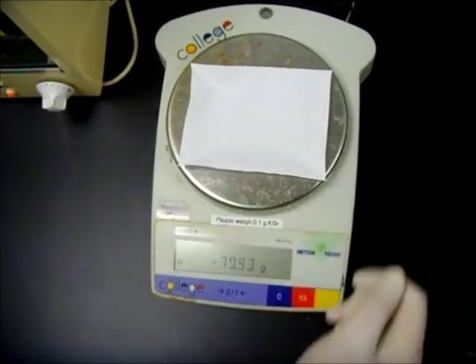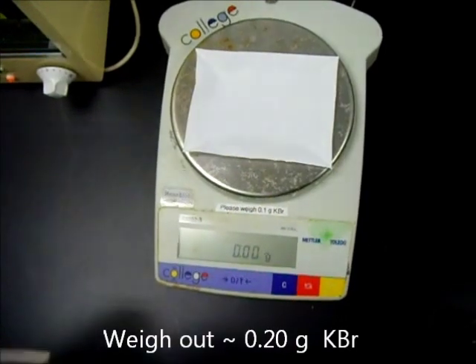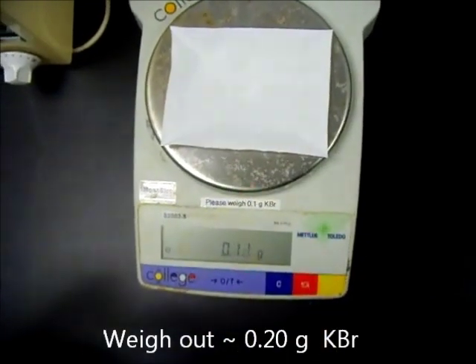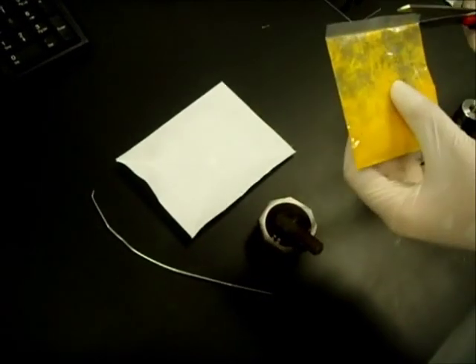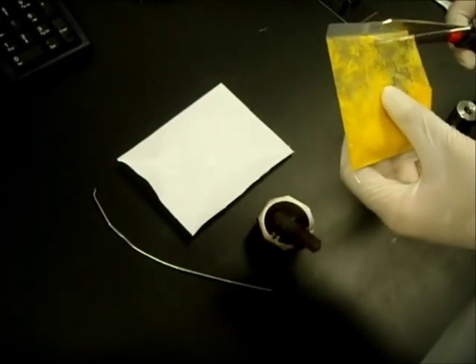Place the weighing paper on the weighing balance and measure out about 0.200 grams of potassium bromide. Scoop up a speck of your solid sample — it should be about 1% of the amount of KBr you have added in.